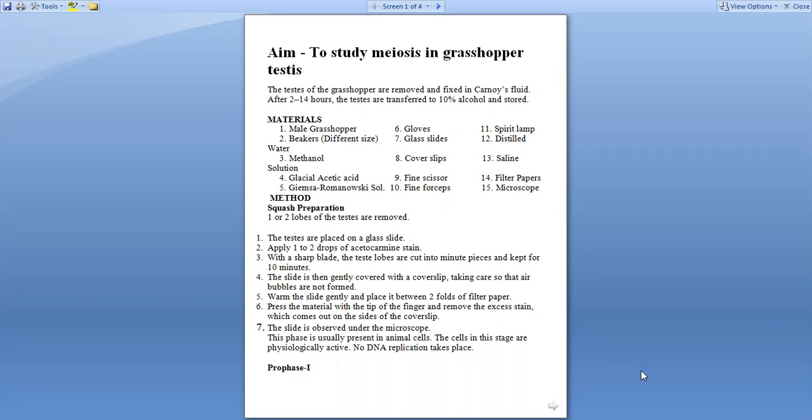First is to prepare a smear. One or two lobes of testes are removed and placed on a glass slide. Apply one to two drops of stain, that is acetocarmine stain, and with a sharp blade the testes lobes are cut into minute pieces and kept for 10 minutes. The slide is then gently covered with a cover slip, taking care so that air bubbles are not formed. Warm the slide gently and place it between two folds of filter paper. Press the material with the tip of the finger and remove the excess stain which comes out from the edges of the cover slip.